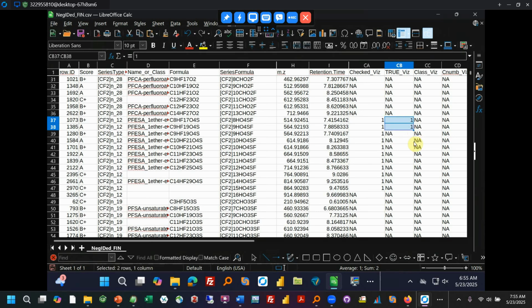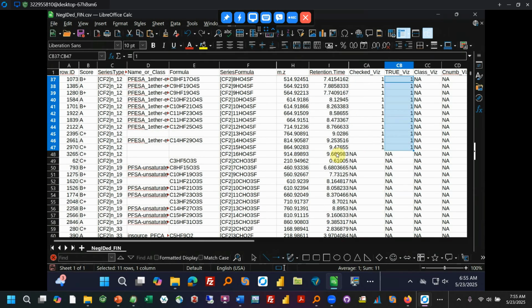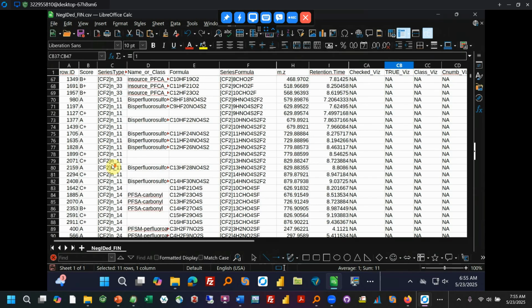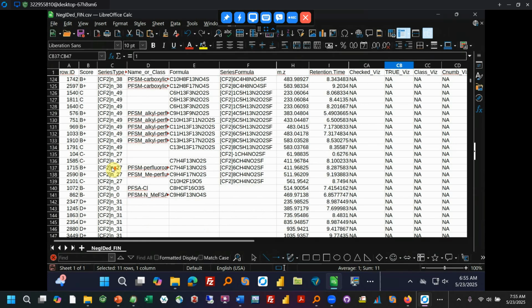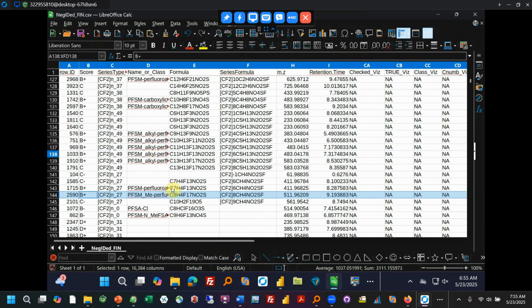All right. So you would continue this process. Obviously, you wouldn't have skipped the carboxylic acid. You'd just keep going down. The question I often get is, when do you stop? And that's really up to you when you stop looking down this sheet. So you can see in this case, there's lots of A's and B pluses and C's. So there's a lot of confident hits. And so it might take me a while to get to 138 here.